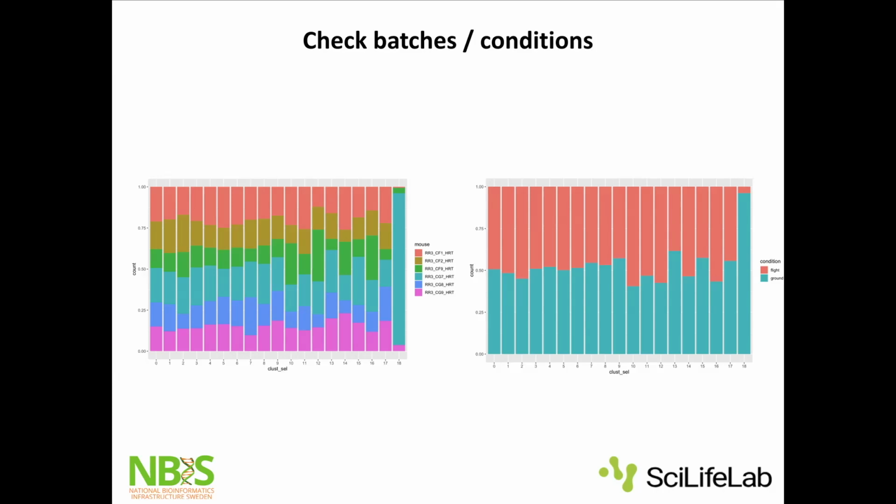I mean, that clearly depends on how you got the samples, right? Yeah. So it's hard to say something generalizable, but when you have problematic samples, I can tell you that it's hours and hours and days working like a detective to figure it out. You look at all kinds of QC stats. You look at genes, you look at ambient RNA, background signal, doublets, filtering in different ways, trying to figure out what's wrong. Can I use this sample?